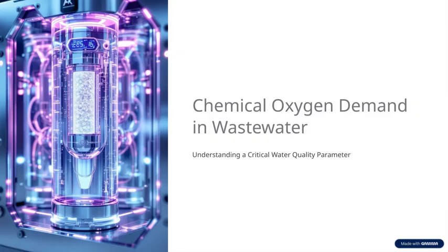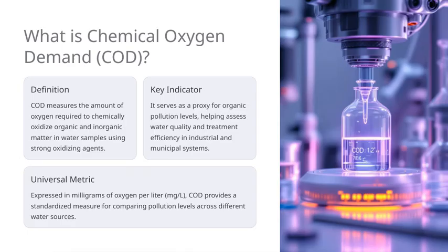Let's get started. Let's start by understanding what chemical oxygen demand, or COD, actually is. Essentially, COD measures the amount of oxygen that is needed to chemically break down organic and inorganic matter in water samples. This process uses strong oxidizing agents to do the job.